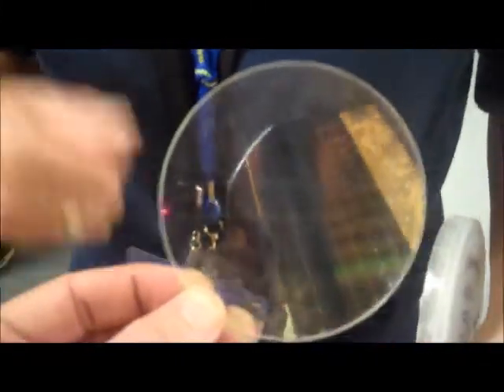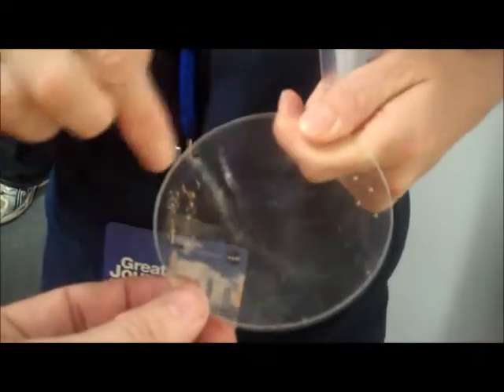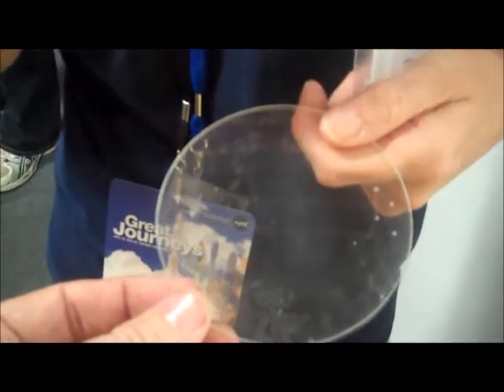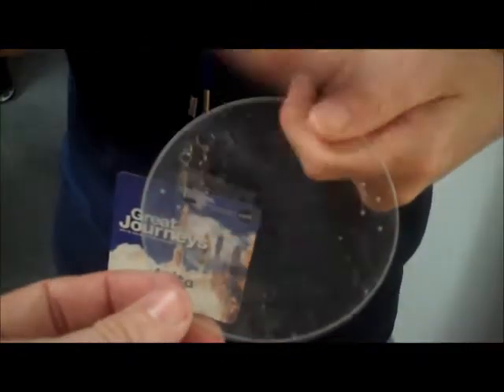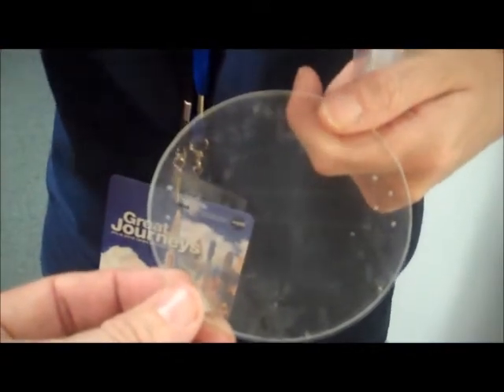So you were saying that the lines are etched in the glass. Yes — you use a chemical etch, make a pattern. The pattern blocks everything except that channel, and then the chemical etches into the glass. Then you wash it away and put a plain wafer on top. So now you have a channel that's 20 microns wide, half a micron deep.